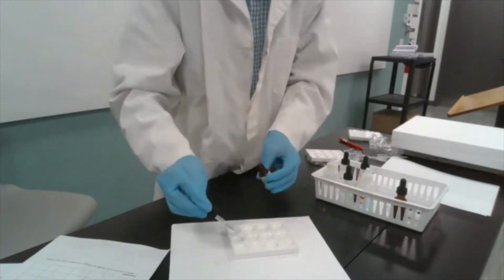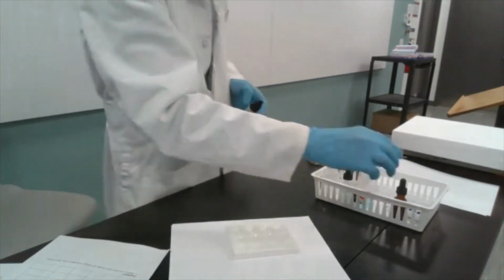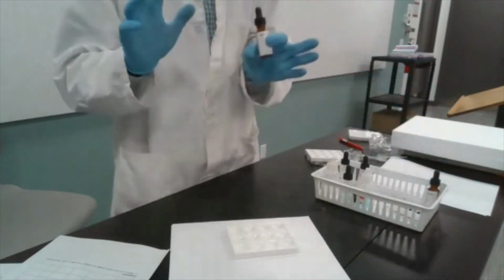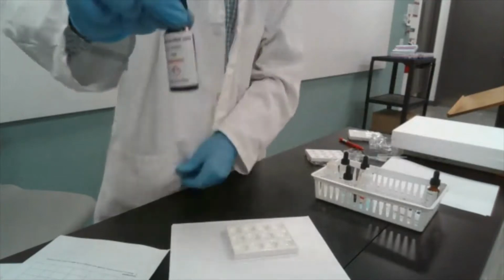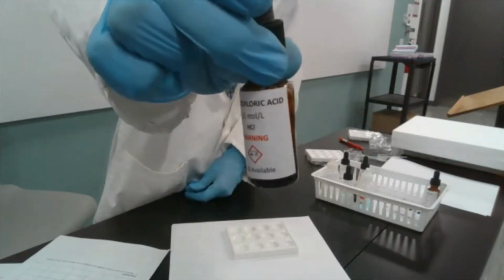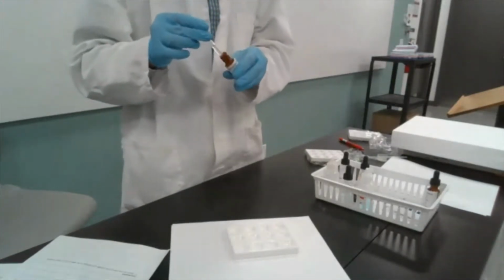And like I said, the whole point of including sodium hydroxide and hydrochloric acid is to use them as positive controls. That's something that we know the chemical nature of without any doubt. So this is hydrochloric acid, and that acid part also gives away what it is.